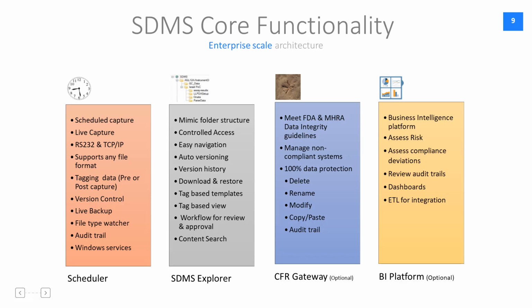CFR Gateway is one unique solution which will help laboratories to meet the data integrity guidelines provided by US FDA and the MHRA of UK. You will be able to manage non-compliant systems in a more meaningful manner in a controlled environment, and you will be able to achieve 100% protection for your data from being deleted or renamed or modified.